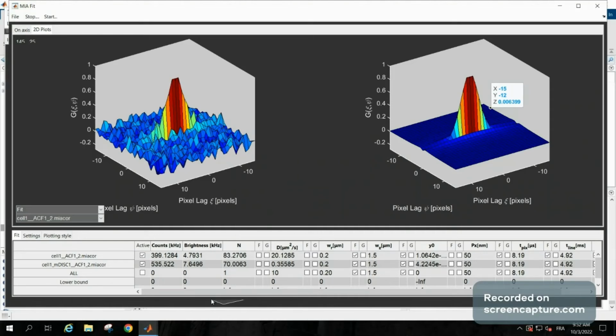Maybe, but we already know that to make up the size of EGFP fused to DISC1, you need five EGFP repeats, and we actually tested that. We tested the diffusion coefficient of that, and we got a value of about 6 micrometers squared per second, which is still faster than EGFP fused to mouse DISC1. So what do you get from this? How do you interpret this?